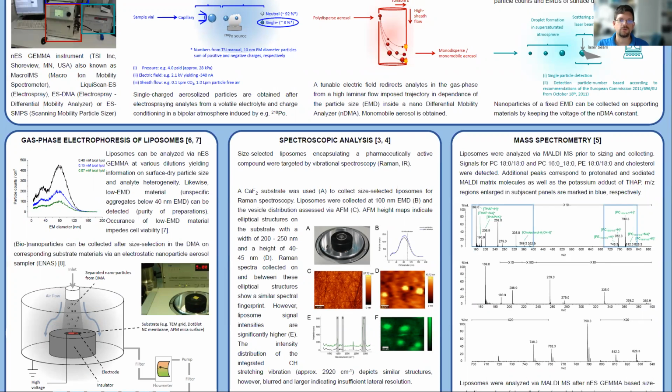And as you can see here, for liposomes, it's possible to get spectra of differently concentrated vesicle samples, indicating that we're indeed detecting liposomes and no unspecific aggregates.